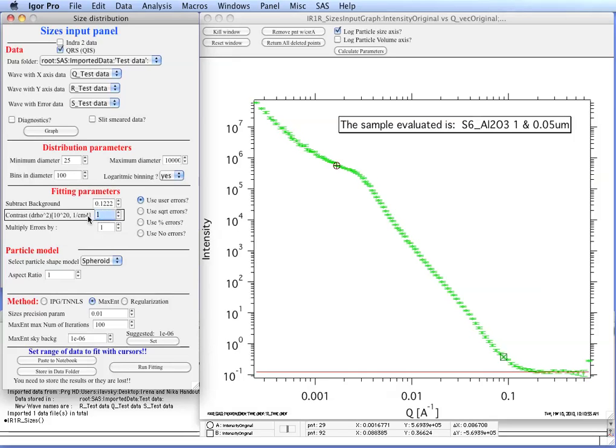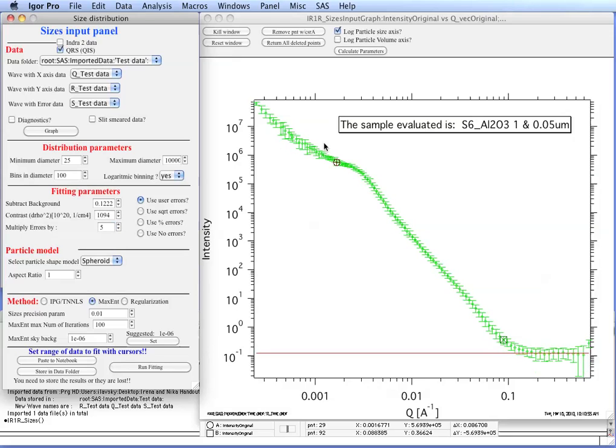Contrast for alumina is 1491, I believe. Let me check on that - 1094 actually. Even though this is powder and the absolute intensity here is probably not well calibrated, because for powders that is very difficult to do, this is the real contrast of alumina against air. For a start there, let's increase the scaling factor to maybe 5. That increases the error bars and makes it easier for the code to reach a solution within error bars.